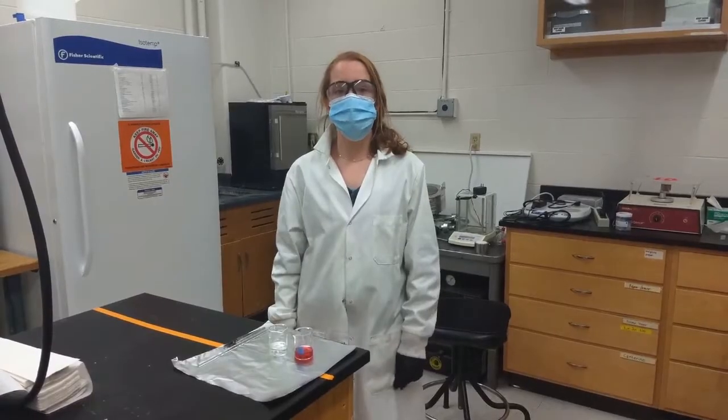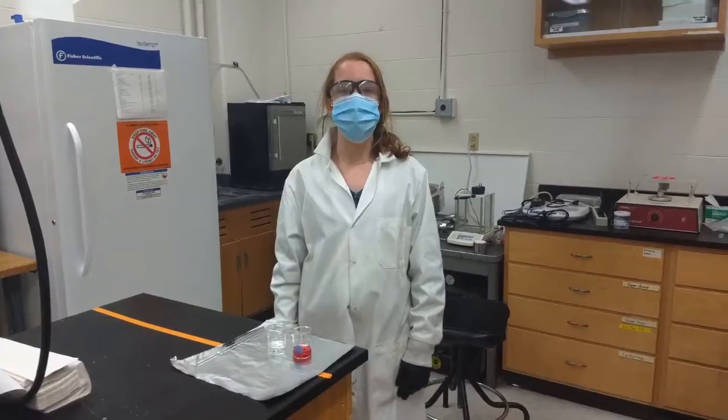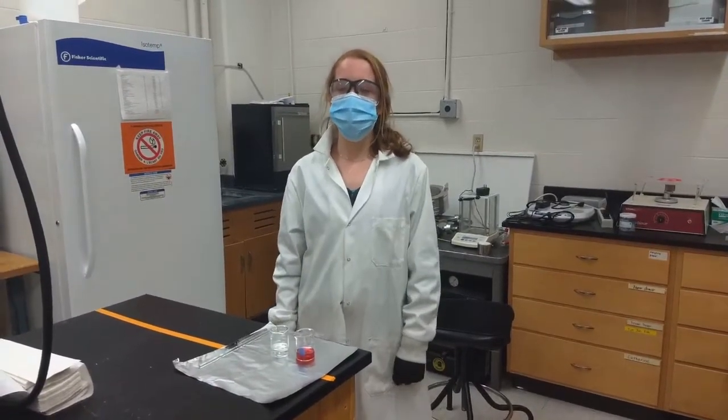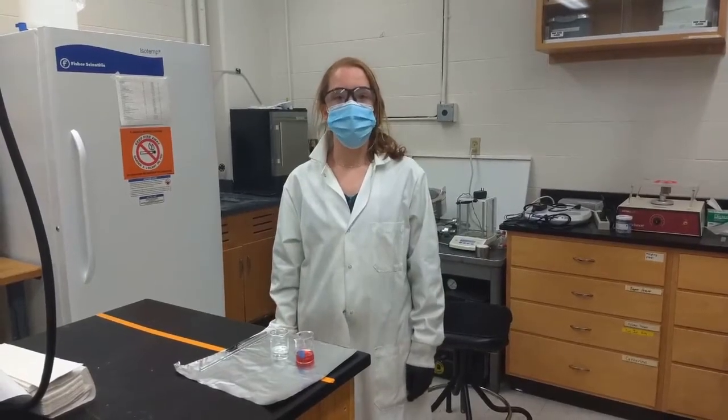An interfacial polymerization is a polymerization that occurs at the interface between two immiscible liquids. Immiscible liquids could be like oil and vinegar that you have in your salad dressing.